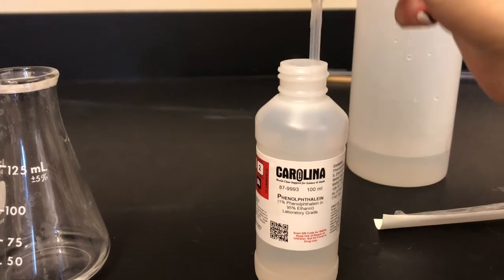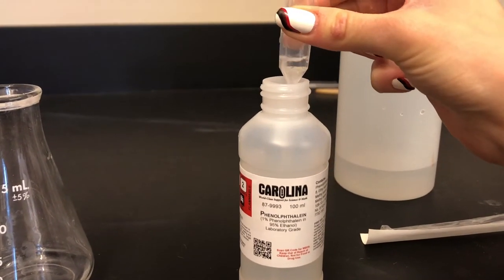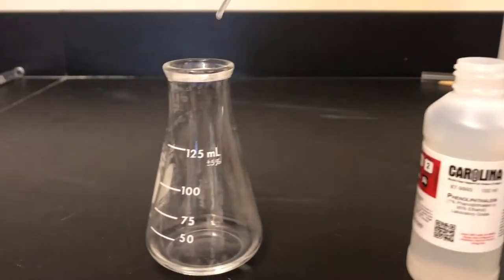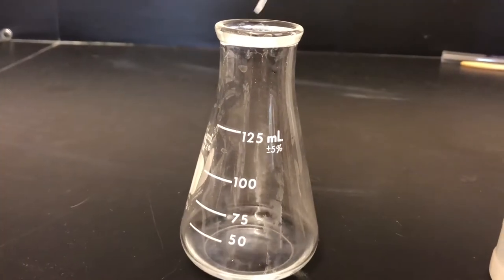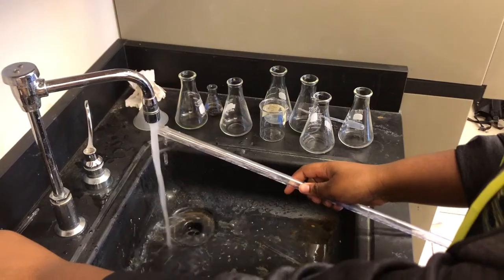The next step is to get the pipette and put 5-6 drops of phenolphthalein into the flask with acid in it. Make sure that your drops aren't large squirts. Also be careful that the drops go right into the acid and not on the side of the flask.